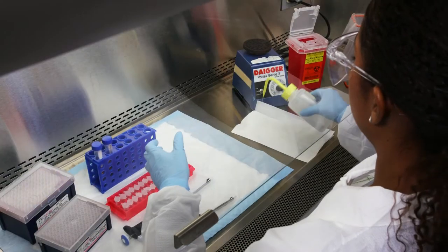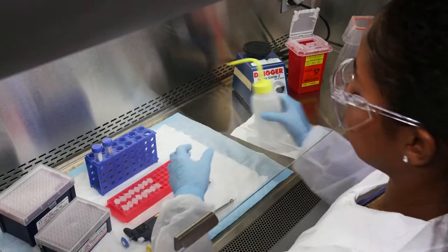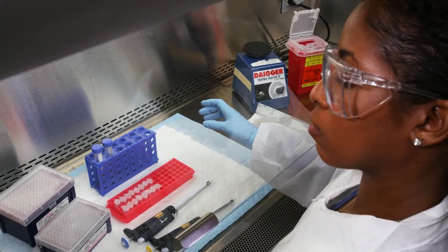Then, repeat the process with more paper towels and disinfectant, this time leaving the wet paper towels on top of the contaminated area for the appropriate contact time to allow for disinfection.